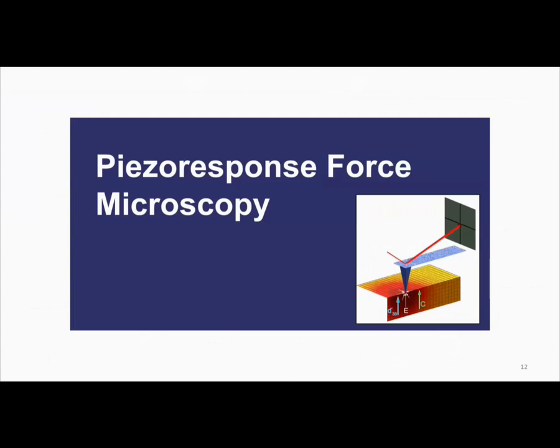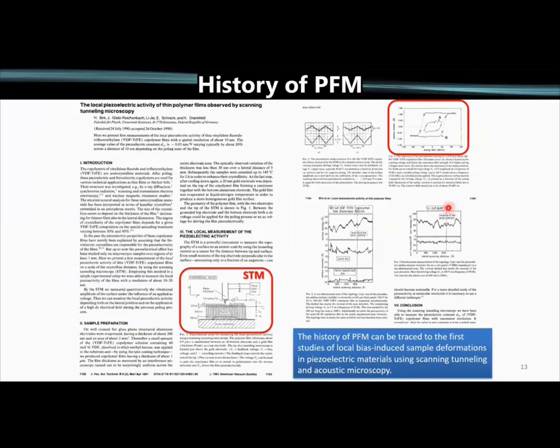So now I'll talk a little bit about PFM. As I mentioned, we had some nice images this morning already, and I'll take this back to the beginning, from these early papers up to some recent history. Hopefully you can see it's not too small, but this is actually the first scanning probe measurement of piezoelectric activity.